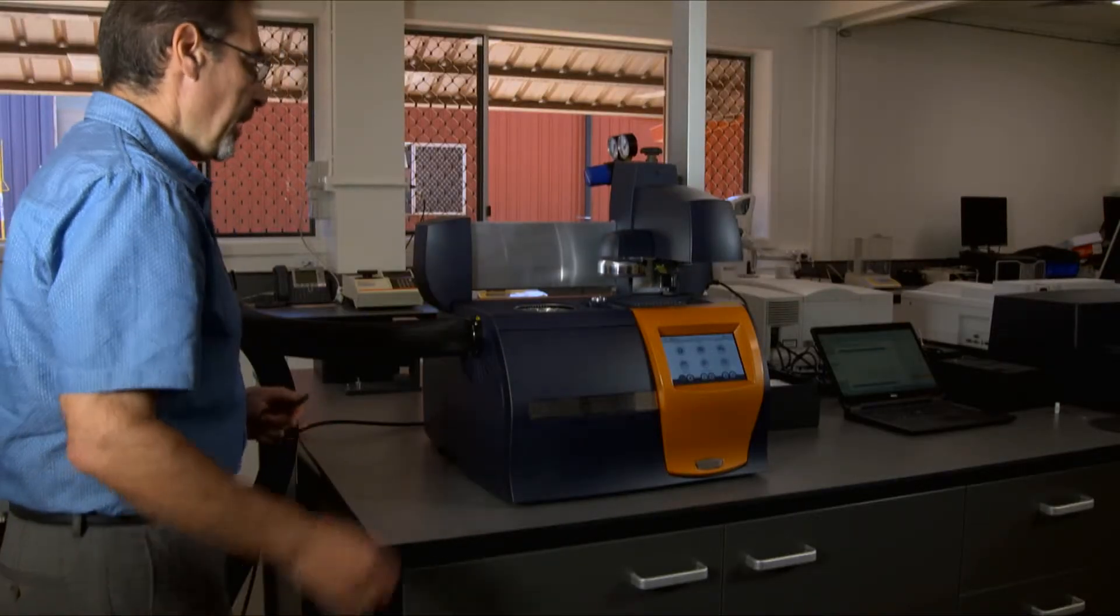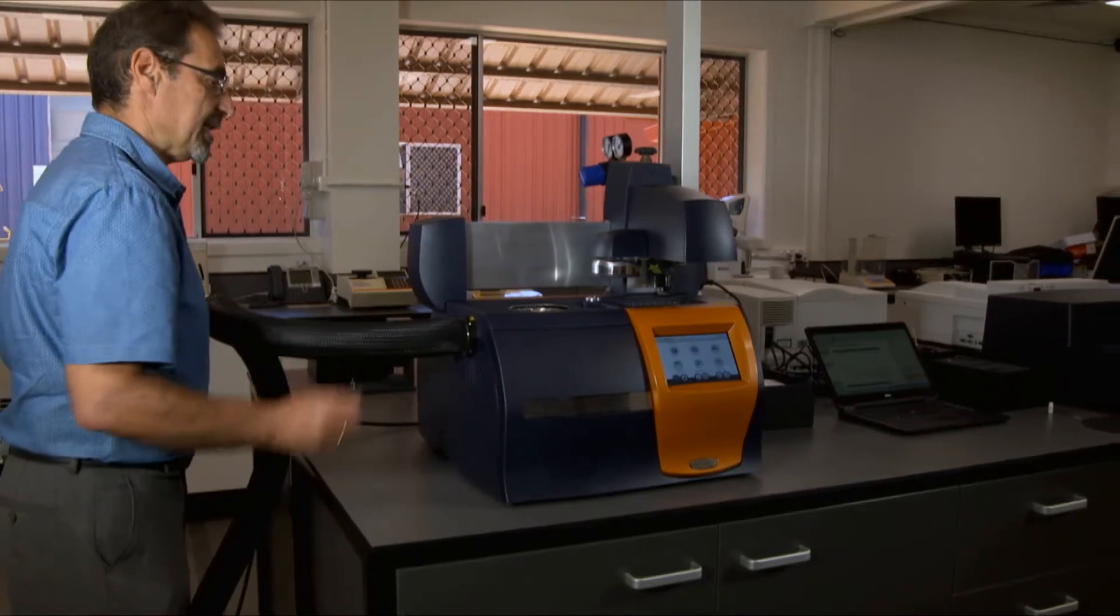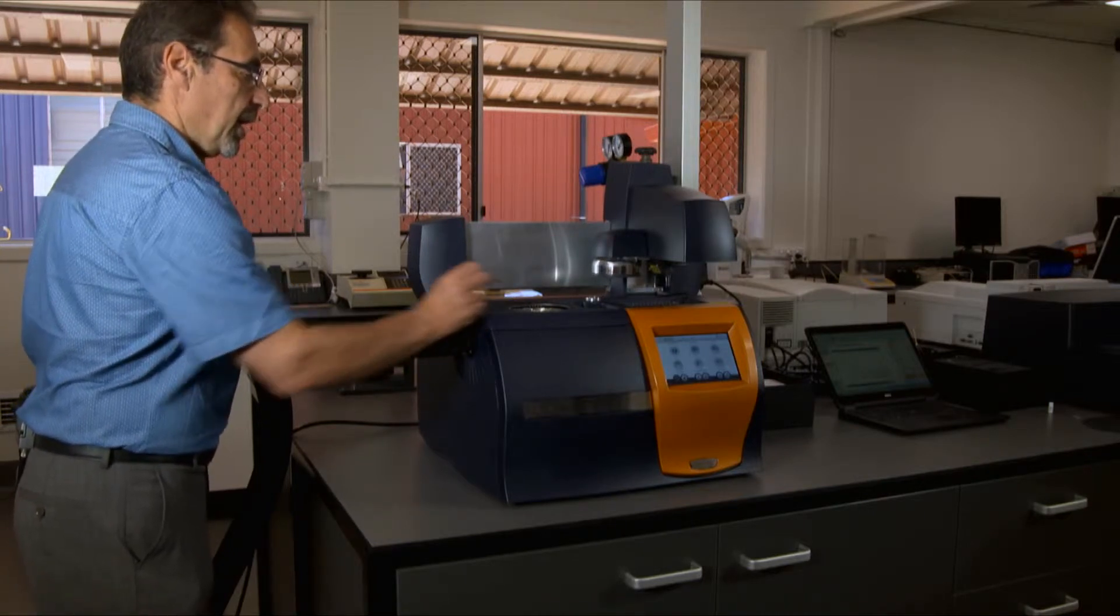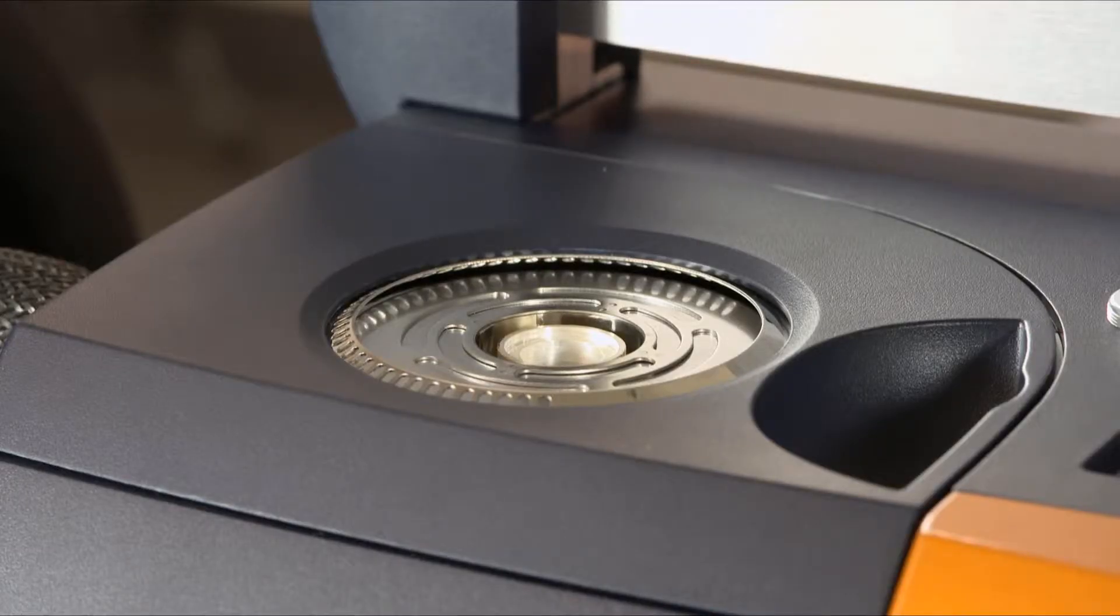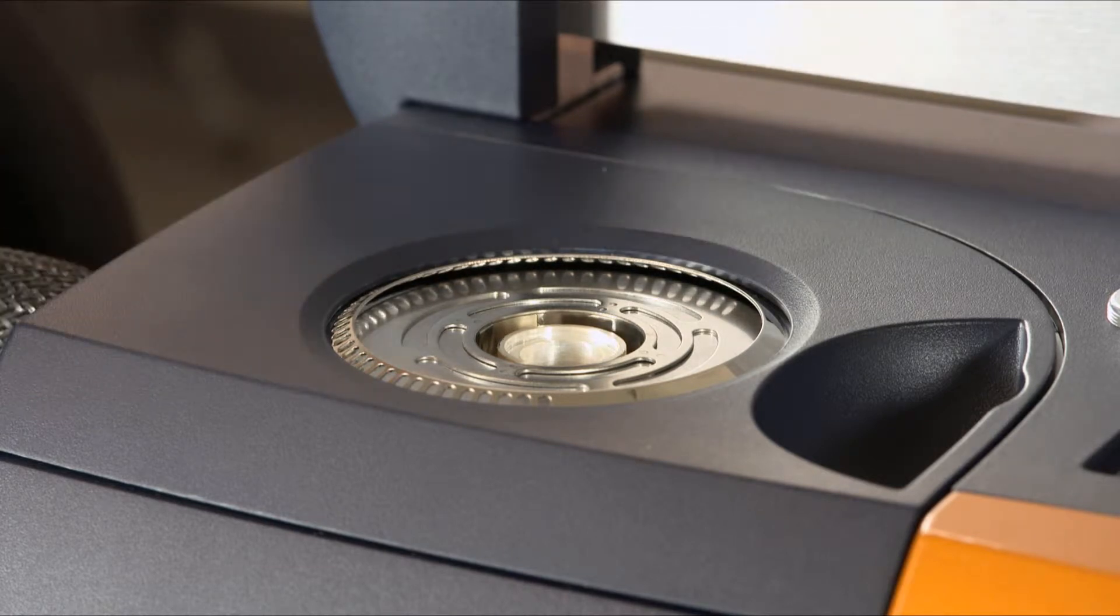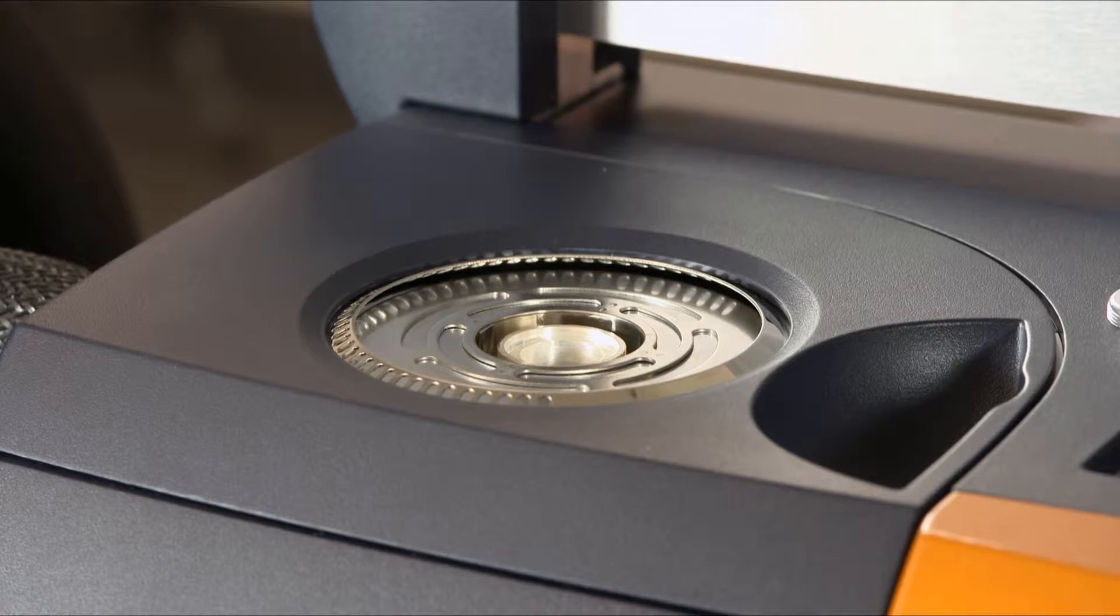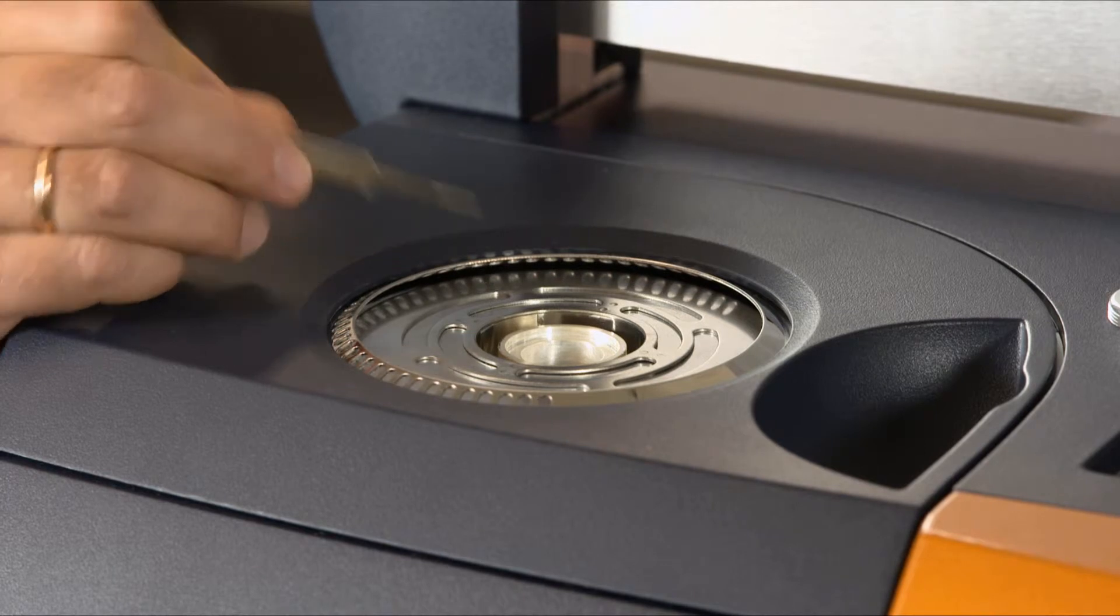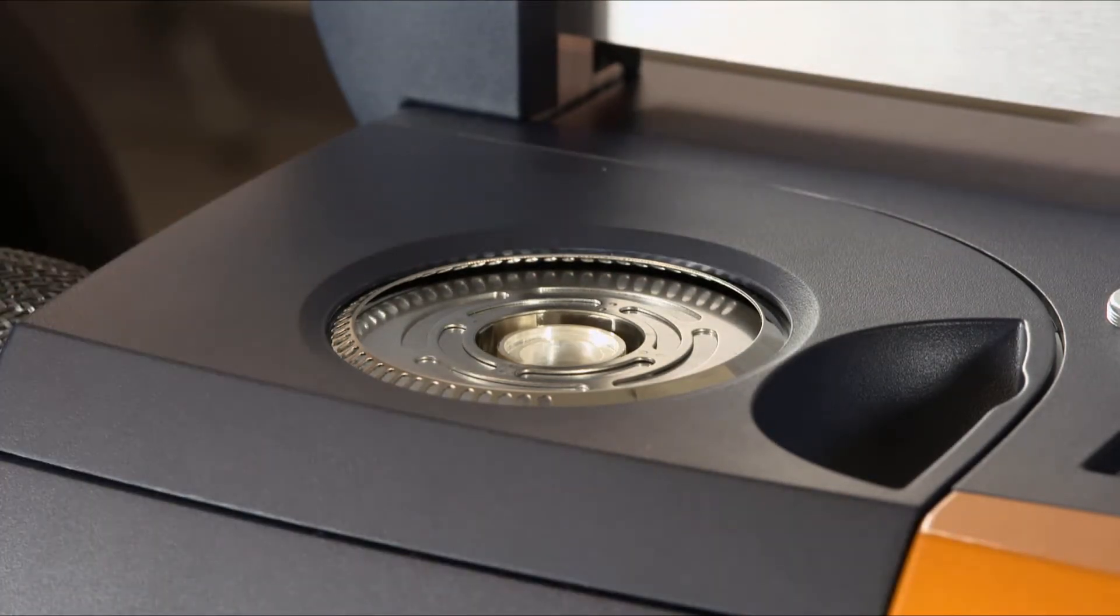The main operating part of the instrument is the DSC cell. It consists of two measuring platforms: one reference for your empty pan, another one is a sample one for the pan with a sample in it. The reference position is closer to the back of the instrument, sample is closer to the front.